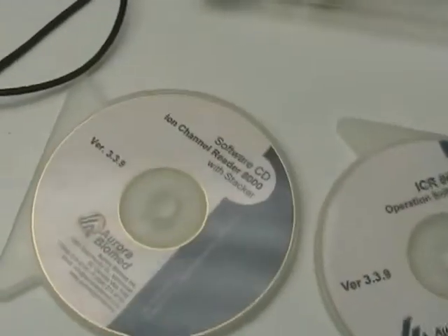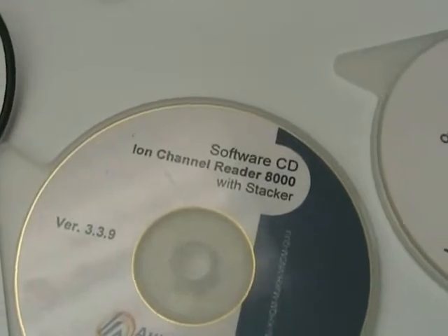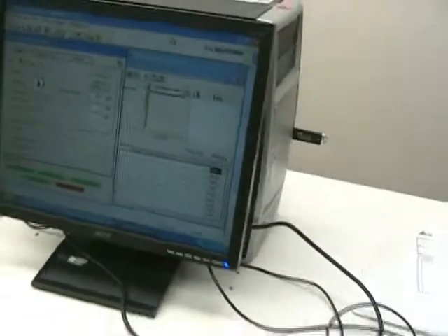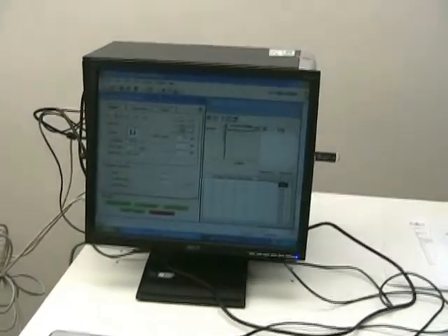Over here we have the computer and software. As you can see on the first CD here, it has the Ion Channel Reader 8000 with the stacker. This is the software that controls the stacker, which we have already pre-installed on the computer that comes with the unit.